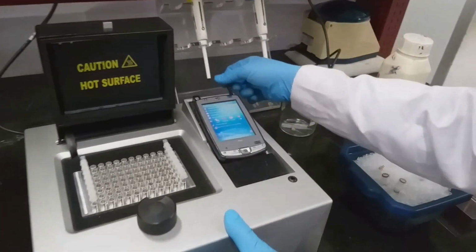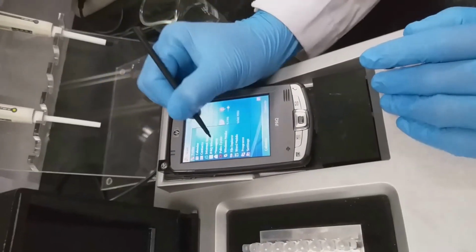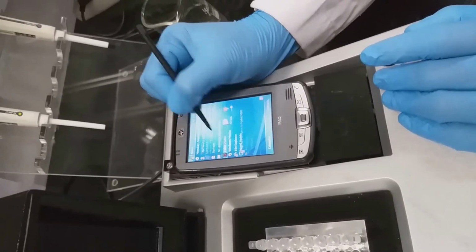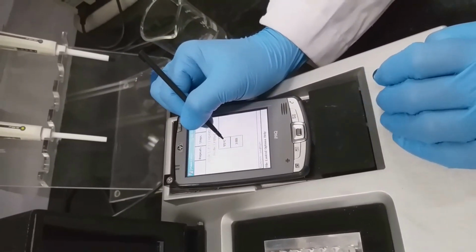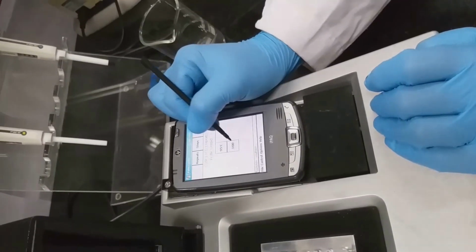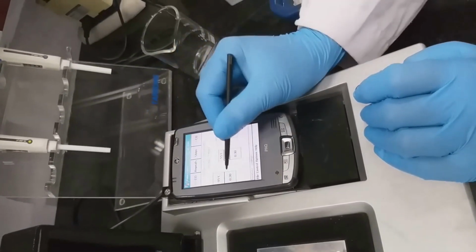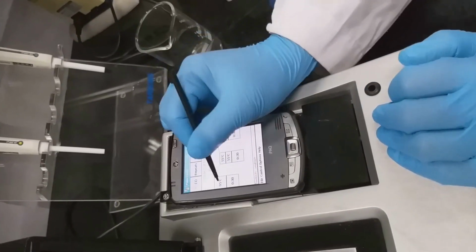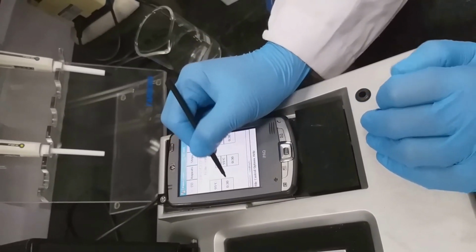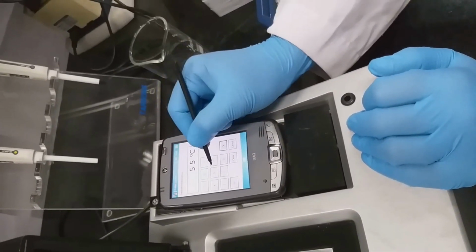For setting up a PCR reaction, initial denaturation at 95 degrees Celsius for 3 minutes, and then for these steps we will use 30 repeats, where denaturation will be 30 seconds and annealing at the appropriate temperature.